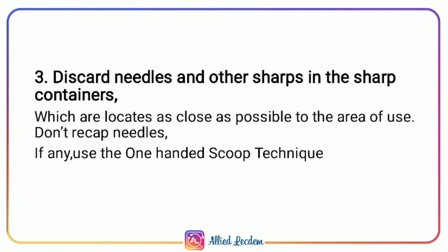Discard needles and other sharps in the sharps containers, which are located as close as possible to the area of use. Don't recap needles. If necessary, use the one-handed scoop technique. We already know about the one-handed scoop technique. It's the correct method for recapping the needle.